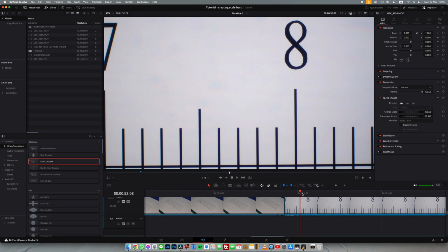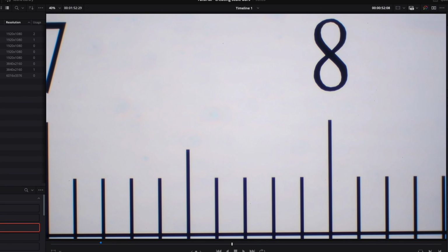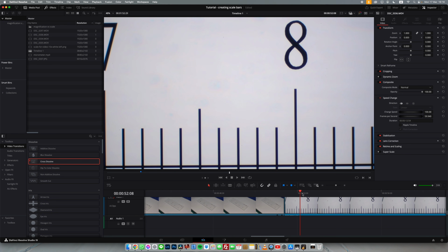The calibration slide will have various scales etched into the glass. Find one of the scales that completely covers the field of view of whichever objective you're using to look at the slide. Here, I've aligned the large hash mark at the 7 millimeter mark with the very left edge of my field of view. And now we can see that my field of view extends for 1.4 plus a tiny little bit millimeters. Now that I know this measurement, I have enough information to do some simple math to calculate the size of my scale bars.